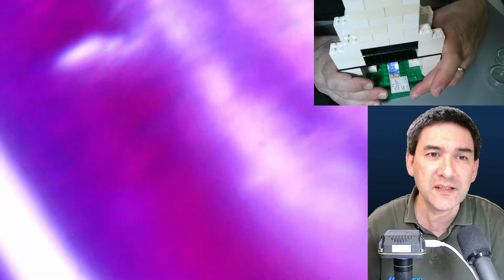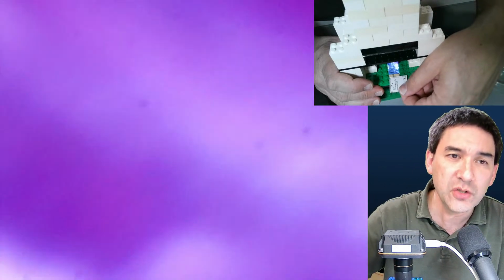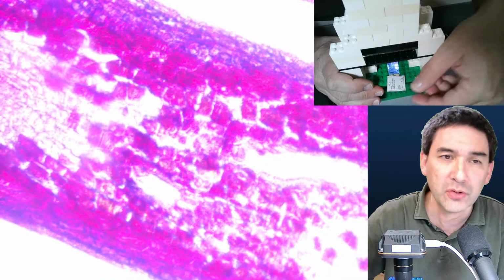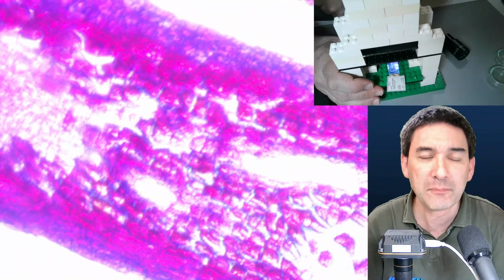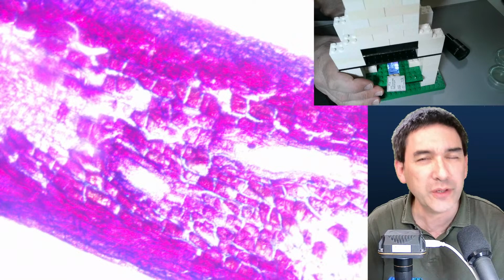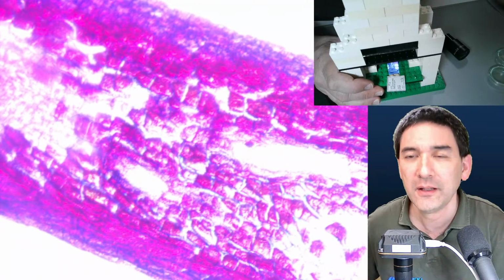However, there is an optimum distance between the slide and the objective, and if you do not keep that distance, then you're introducing other problems, like, for example, it's not going to be clear on the edges and so on. So yes, it is correct. It is possible to also change the magnification by changing the distance, but this only goes up to a certain point.